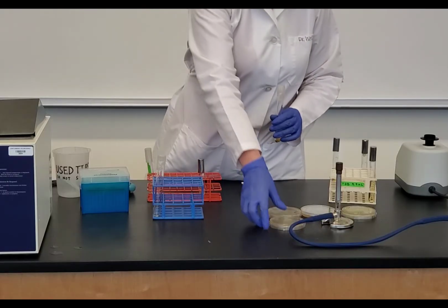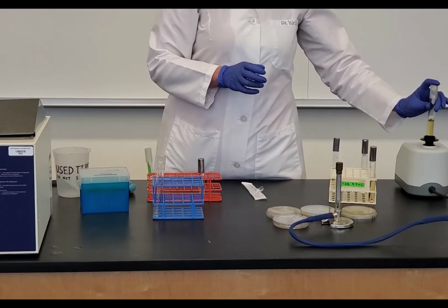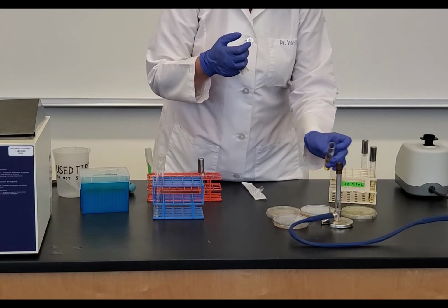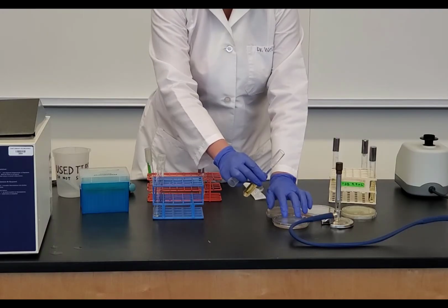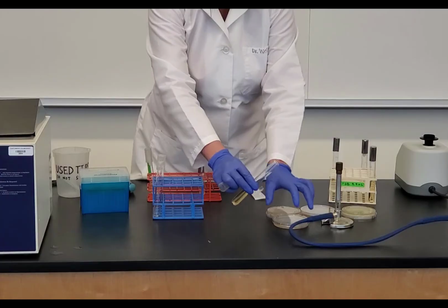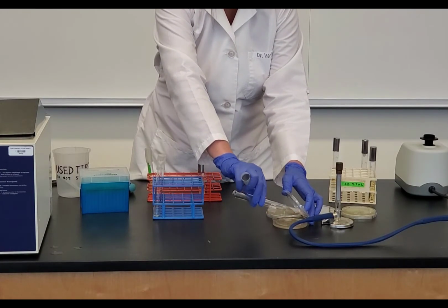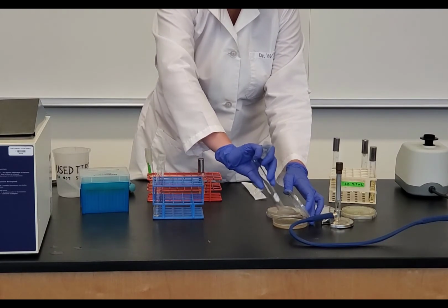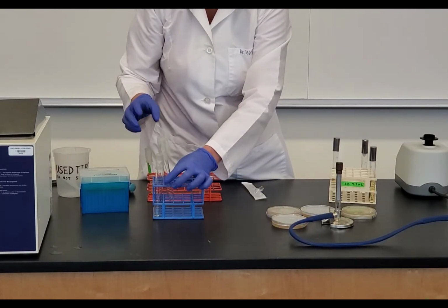Now I need to pour it, so I'm going to turn over my 10 to the negative 7, and I'm going to vortex to mix very carefully. I don't want to create too many bubbles. I'm going to flame the opening, and again, I'm going to let it cool for just a minute so that the opening of the tube is not too hot to kill the virus or to inactivate the virus and to kill the bacteria. And then I'm going to pour this. And then I'm going to recap this, and I'm done with this one.